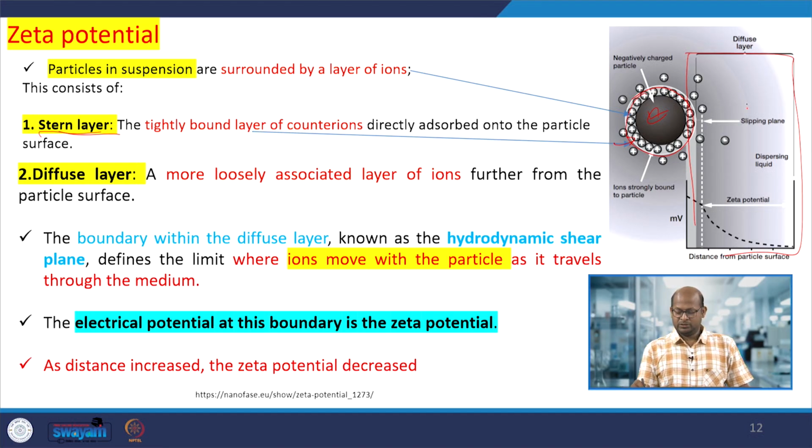So here, the ions can move. When particles move, the ions also move from one particular point to another particular point. So when the particle is moving, the ions are also moving. Okay, so here the potentials will develop. After a small distance, you can say there is a diffuse layer. So here the potential or charge develops in that particle.